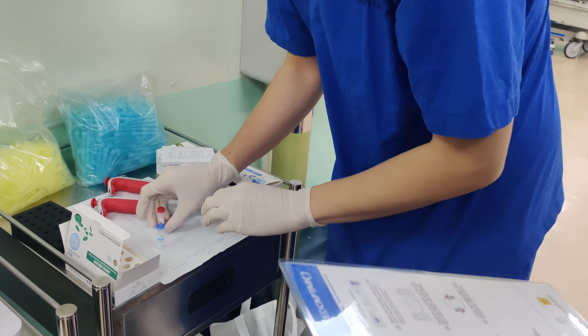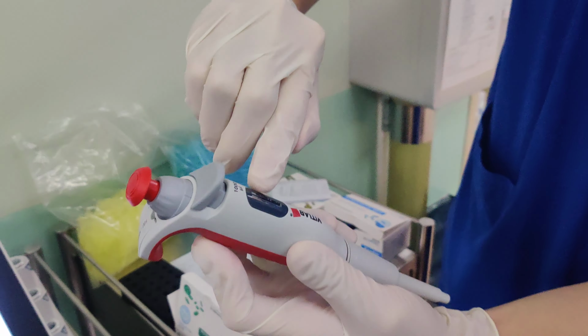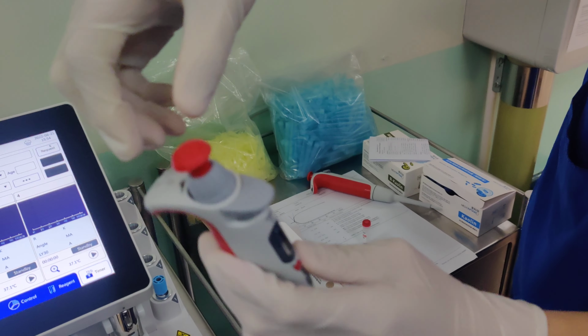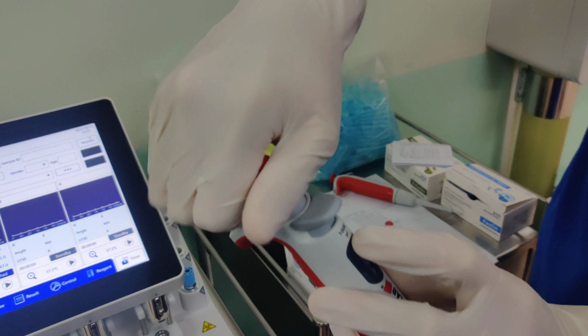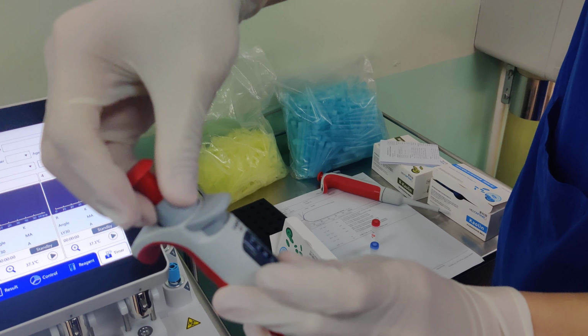This one we will need 1 ml of blood. So for this, we will use the bigger one. You can see, this is set to 340 microliter, so we need to set to 1000. How to set? We twist this grey part. You see, the volume is increasing. So 1 ml is 1000 microliter. So I set it to 1 ml.